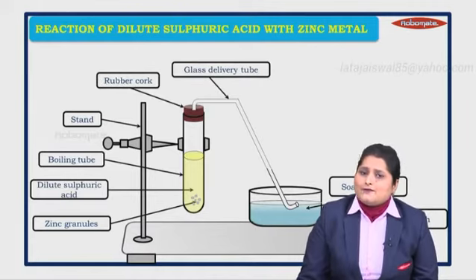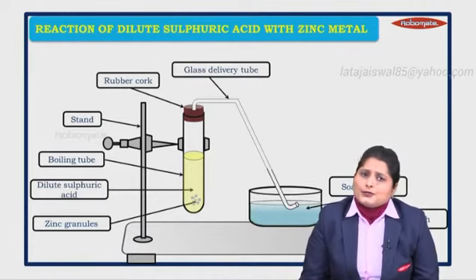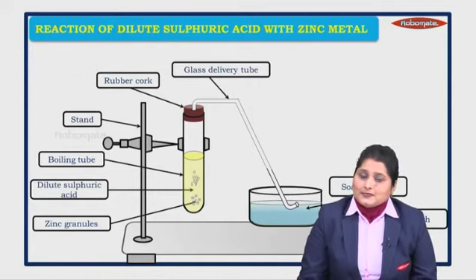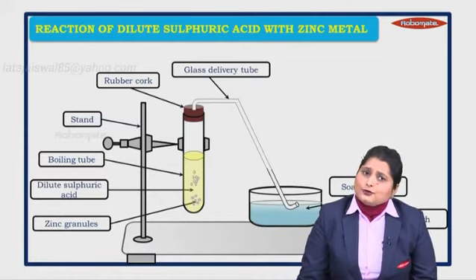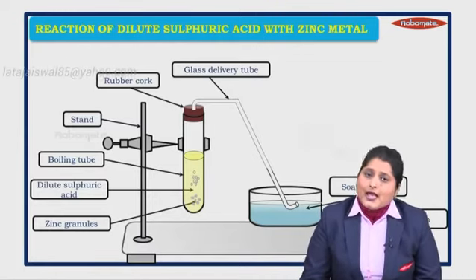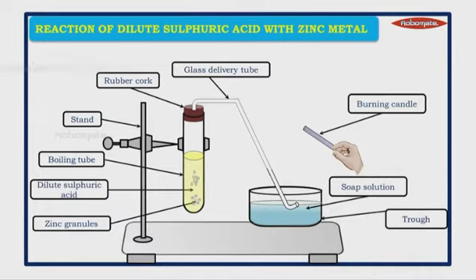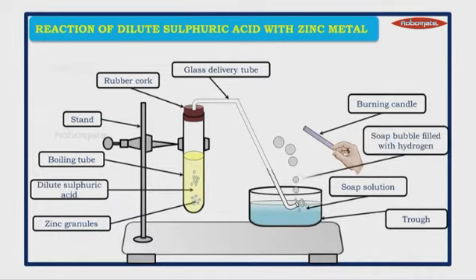As soon as we add dilute sulfuric acid, the reaction takes place and we see the formation of gas bubbles. The gas bubbles come up, travel through the delivery tube, and enter into the soap solution. Just outside it we take a burning candle. The moment the reaction takes place, there is a release of gas — soap bubbles filled with hydrogen gas.